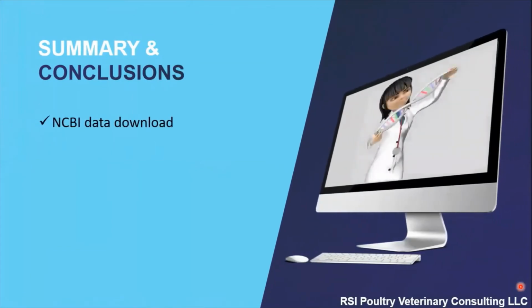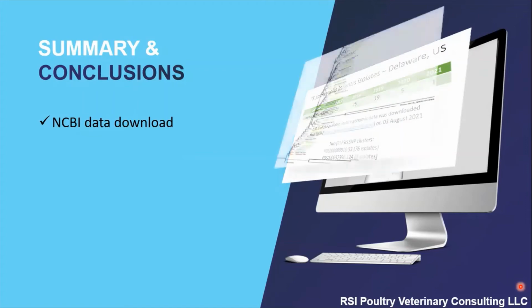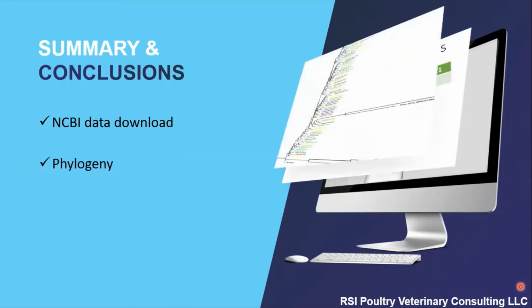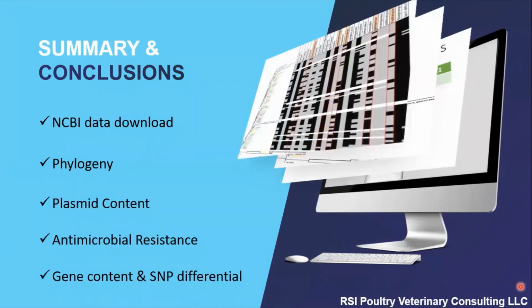To sum up, we analyzed genomic data of 78 Salmonella Infantis isolates recovered from comminuted chicken samples collected by the FSIS in Delaware between the years 2017 and 2021. The genetic data was used to determine phylogeny or genetic relationship between the isolates and references, and also to determine the plasmid content, antimicrobial resistance profiles, gene content, as well as mutations in genes that may help differentiate isolates between or within phylogenetic groups.